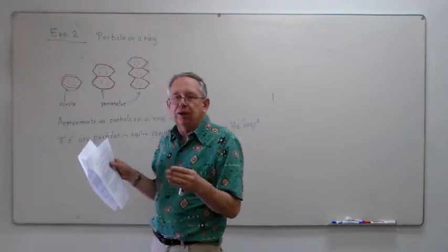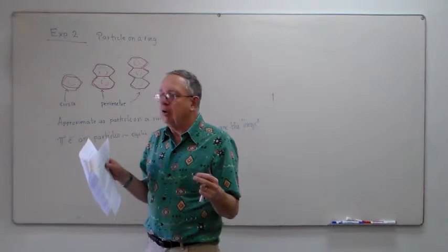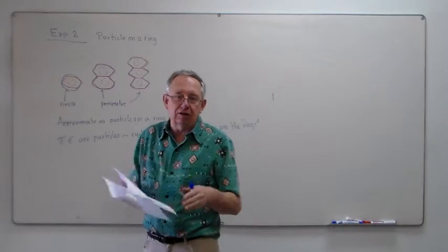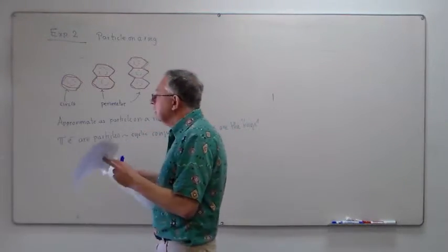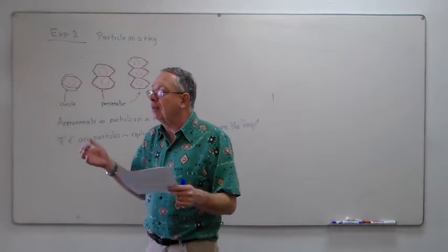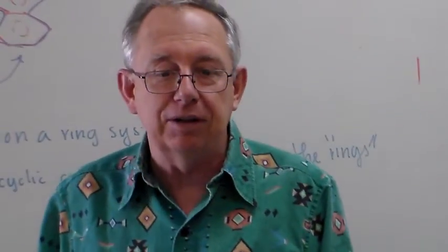We've gotten beautiful results in previous years, and I have no doubt that today you're going to have another very successful lab experiment, just like you did for the linear case in last week's lab. So at this point, the next step is to go to the stockroom, to go to the labs and find these molecules and measure their spectra.